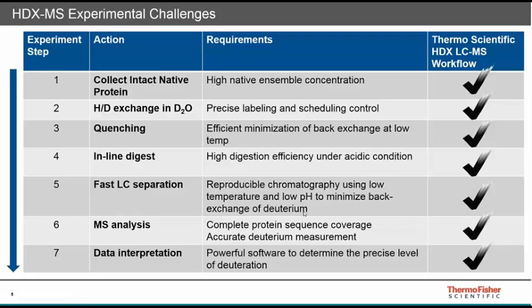For the mass spectrometer, high resolution is really crucial because it's needed to detect the isotope patterns of larger peptides, higher charged peptides, and also for distinguishing overlapping patterns for peptides that are close in mass. Also, it's necessary to get the complete sequence coverage of the protein, or as complete as possible, for accurate measurement of the deuterium uptake.